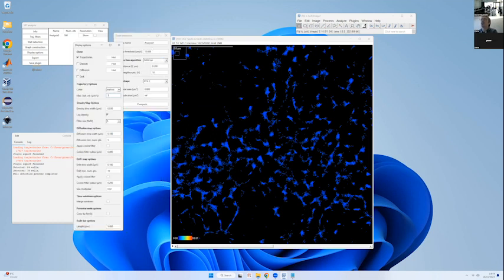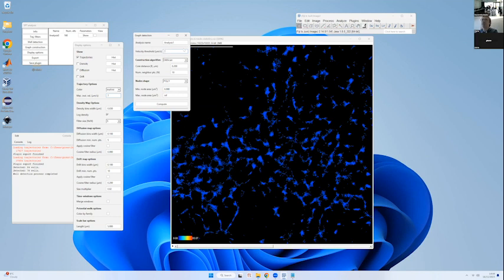So now in the graph detection, I can say, okay, my velocity threshold will be 7. The 2 DBSCAN parameters, you need to play a bit with them to find what's the best. I did it before, and I found that if I choose R equals 0.1 and N equals 10, it's fine.